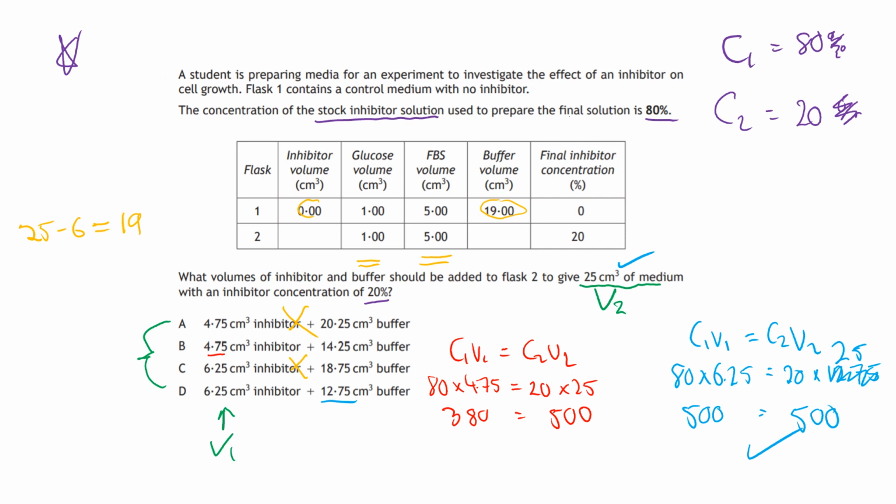Okay, that is a hard multiple choice question. Always check for your final volume if anything else is being added to make up that final volume, not just your stock solution and water or buffer if you're diluting it.